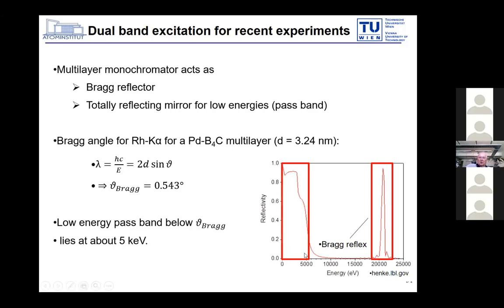If I go with the higher Z elements, I go with 50 kilovolt to get a good excitation from the anode material, the rhodium. And if I only want a more pronounced L line, I go with a lower voltage, and we found out this 28 kilovolt is perfect to give a very strong rhodium L line, and also with a higher current to achieve these 35 watts we can do.